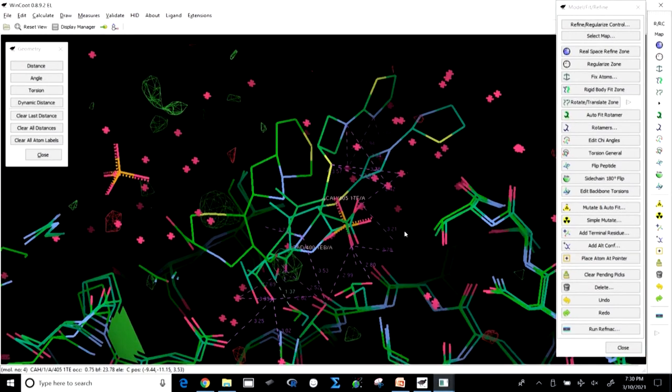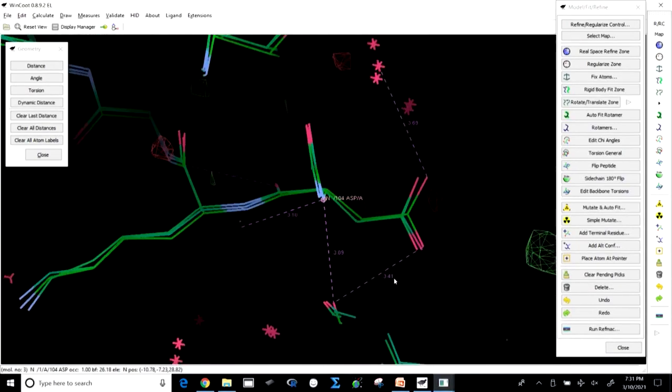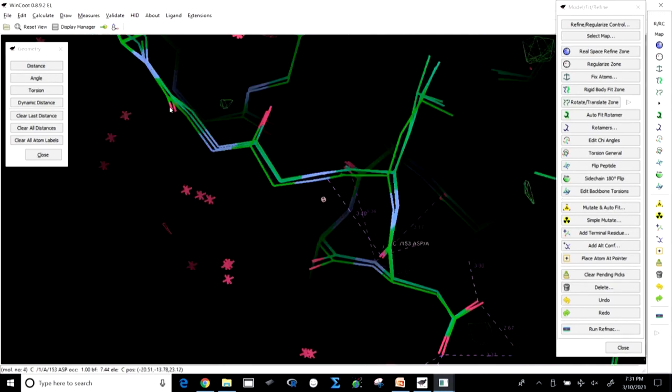So, those changes, those movements are really critical, which was not apparently observed in normal biochemical analysis, but when you are comparing all those structures, you get the movements of those small molecules, as well as you will find the movement in the amino acids.